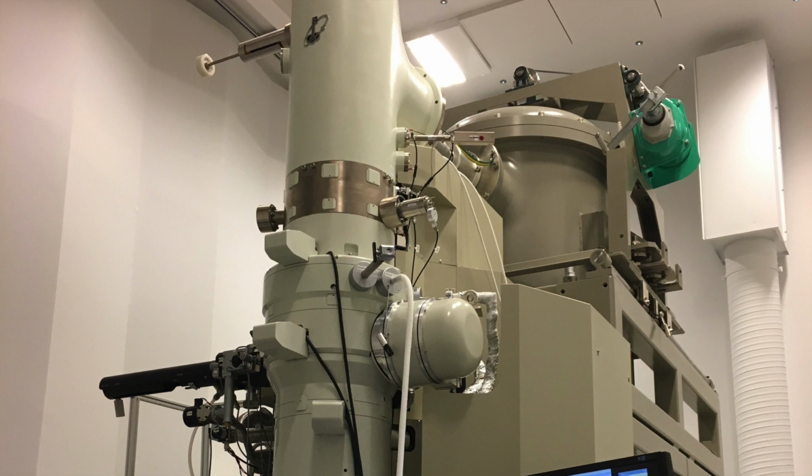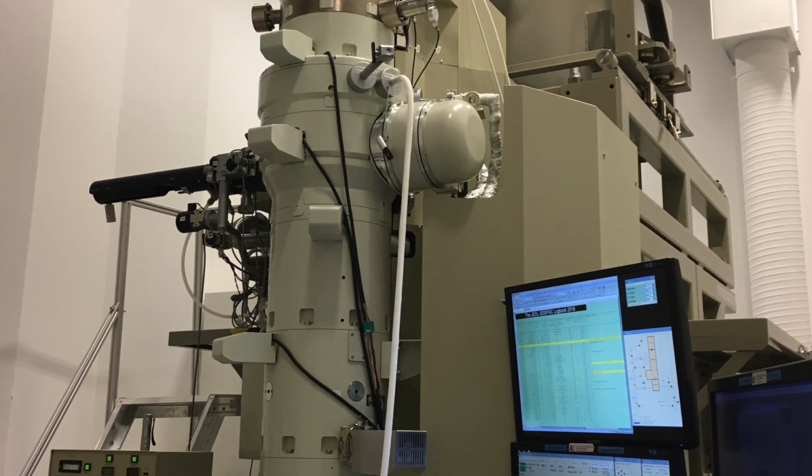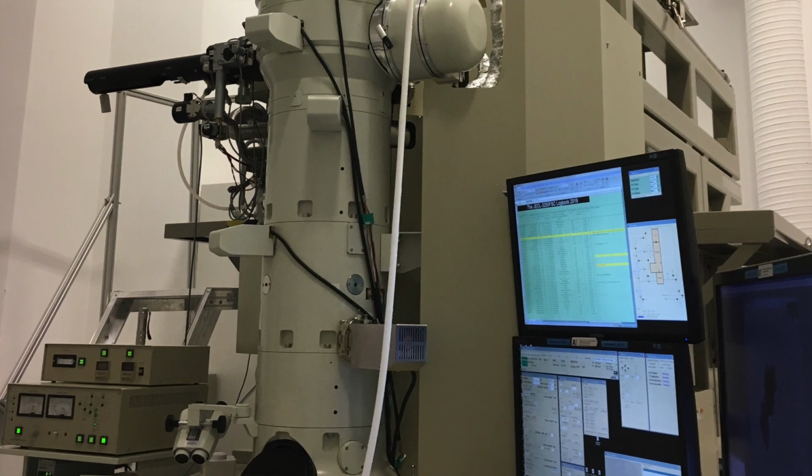Furthermore, the increasing complexity of the microscope is also a challenge for teachers, students, and researchers to understand the working principle. Digital tools such as virtual microscope simulators can overcome the traditional challenges by empowering learning, teaching, and training.